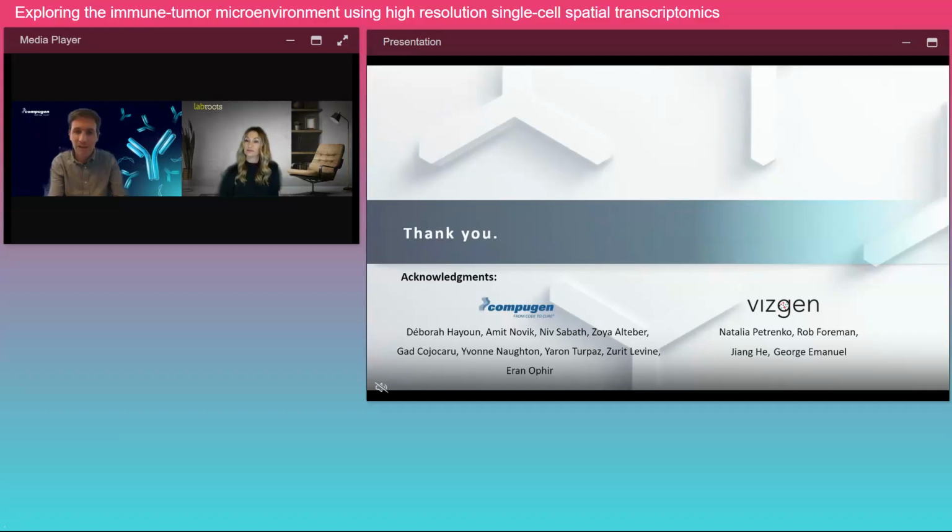Yeah, for cell segmentation. So we've developed some of our own proprietary methods. We examine the raw polygons. We define some of the logic, because it's proprietary, can't really reveal. But basically, it's something relating to how the cells look like and what's the right shape, what's the right order of the polygons.